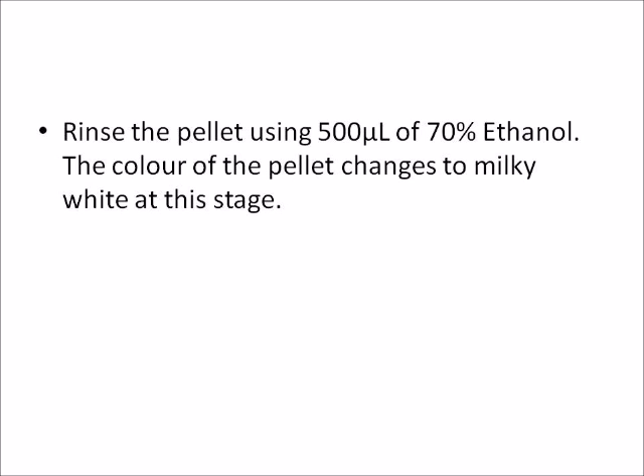Rinse the pellet using 500 microliters of 70% ethanol. The color of the pellet changes to milky white at this stage.